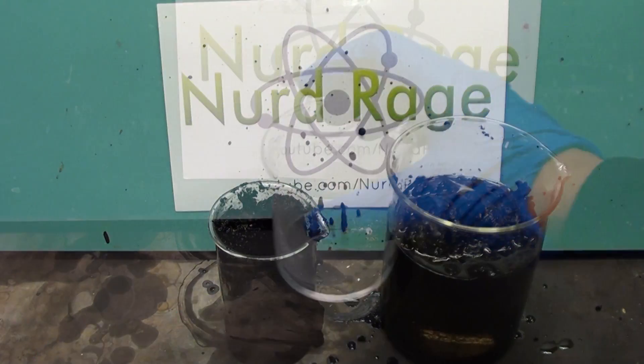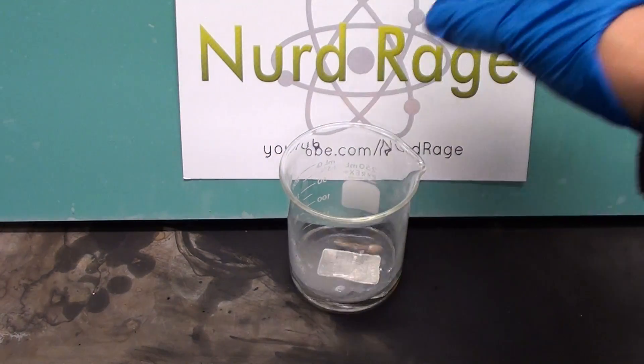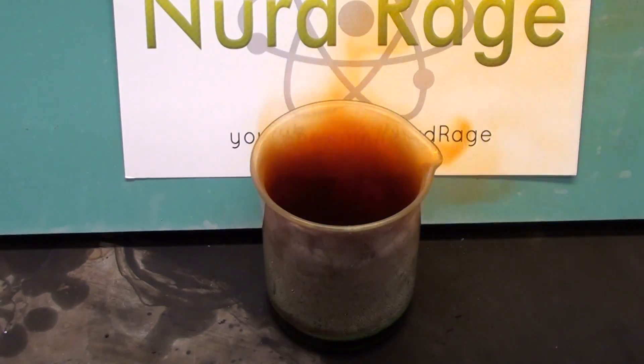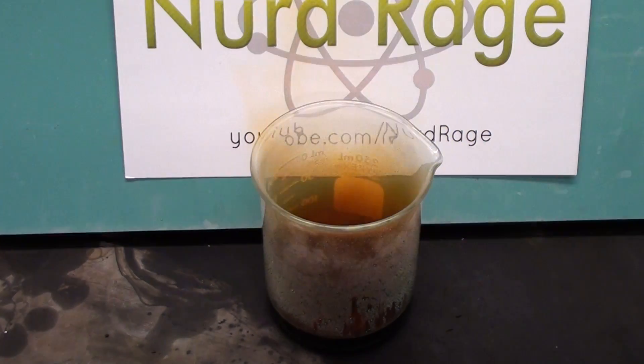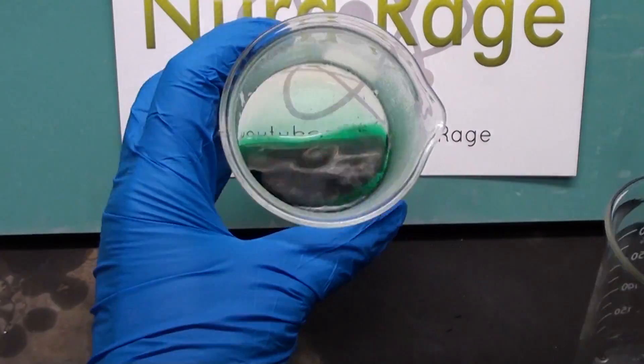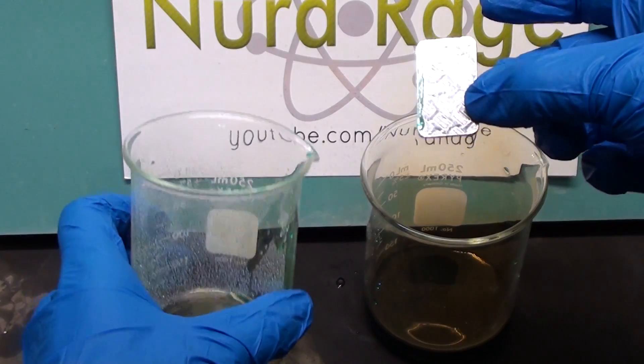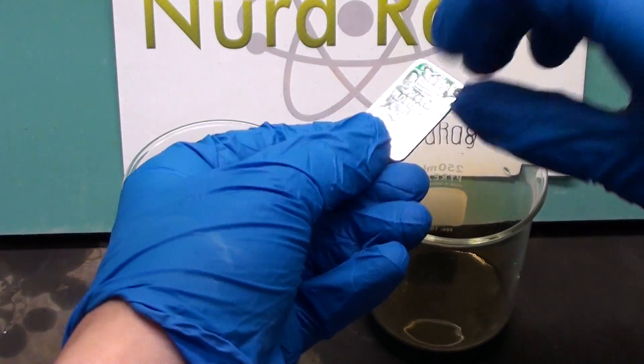Now for the nitric acid test. For comparison I'm also going to toss in a piece of copper. The nitric acid is reacting with the copper to produce copper nitrate and this brown nitrogen dioxide gas. Okay, looks like the reaction is done and here is the platinum bar, completely immune to the nitric acid.